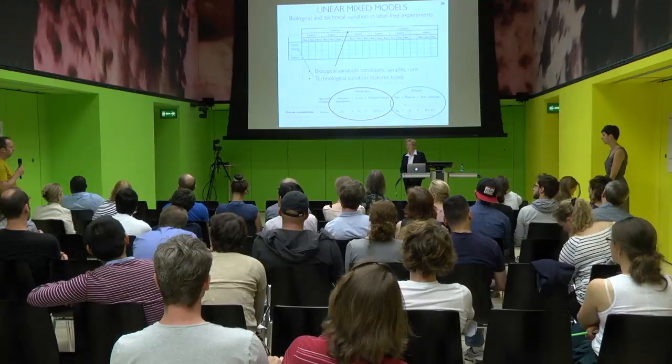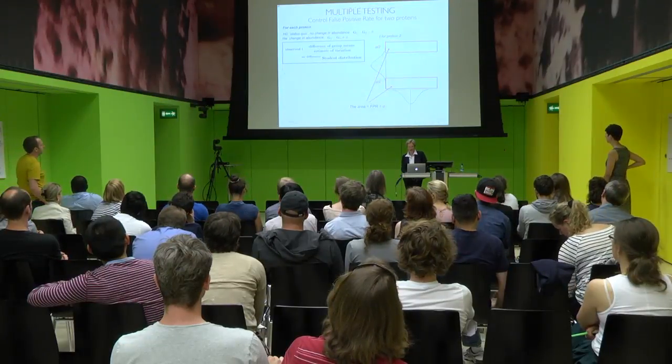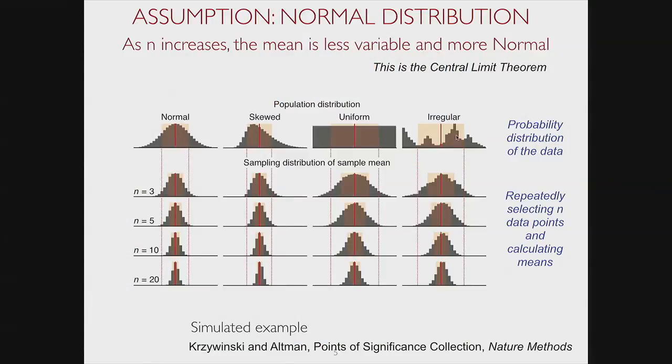But with the lowest value imputation, you have the same number in a lot of fields, right? Doesn't this cause a problem in the group comparison then? Well, with respect to the variances, you are in this situation, right? If I can go back here, you just start with something which looks very irregular, but if the sample size goes up, you can still work with that.